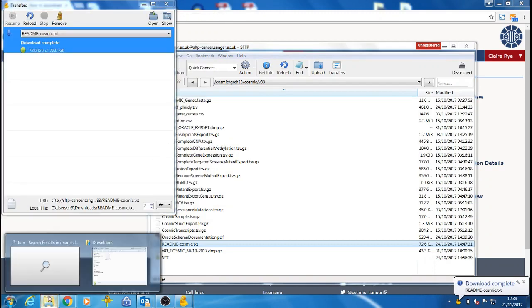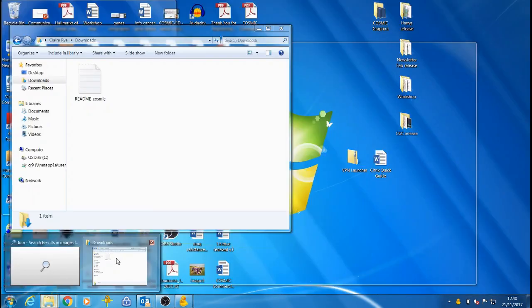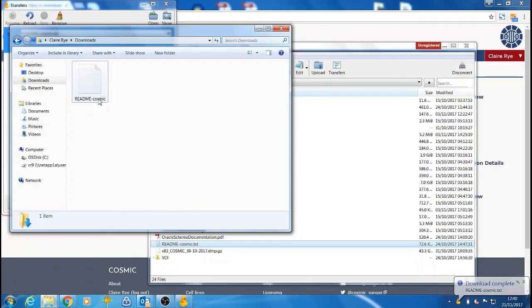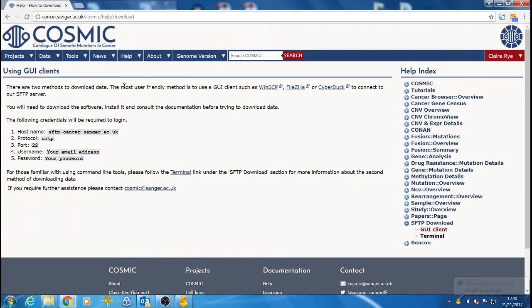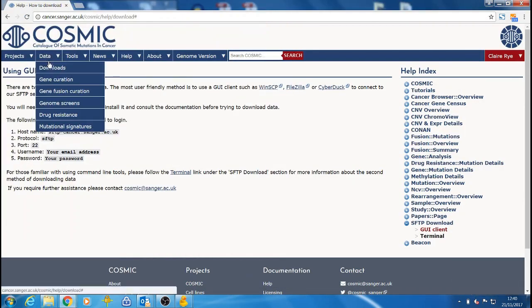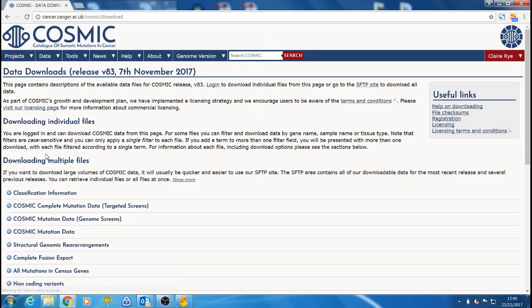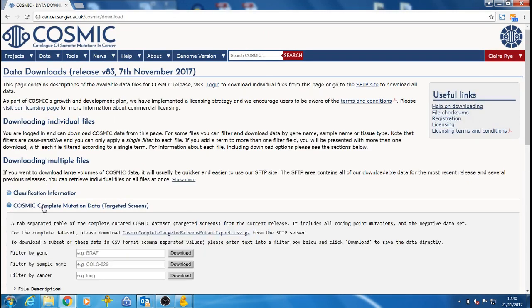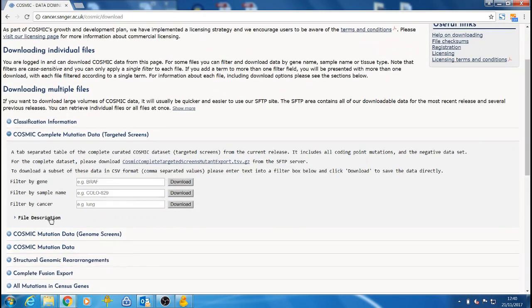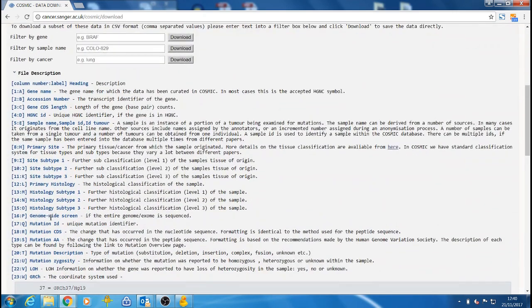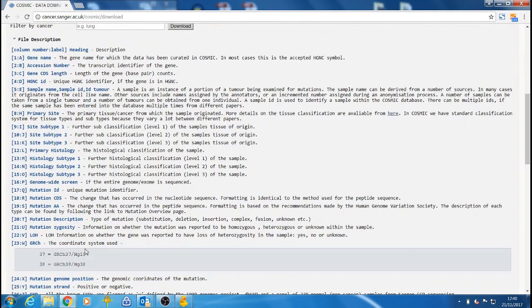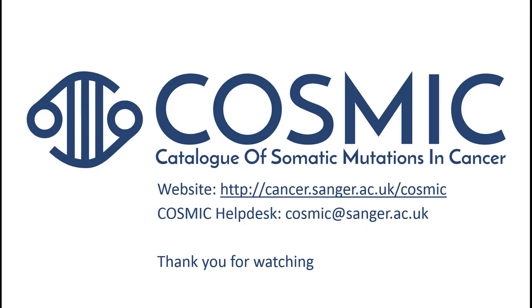If you are unsure which file you need, you can check the contents of each of the files on the Downloads page as we saw previously, using the File Description drop-down. This provides a list of the contents of each file with an explanation of what each column label means.